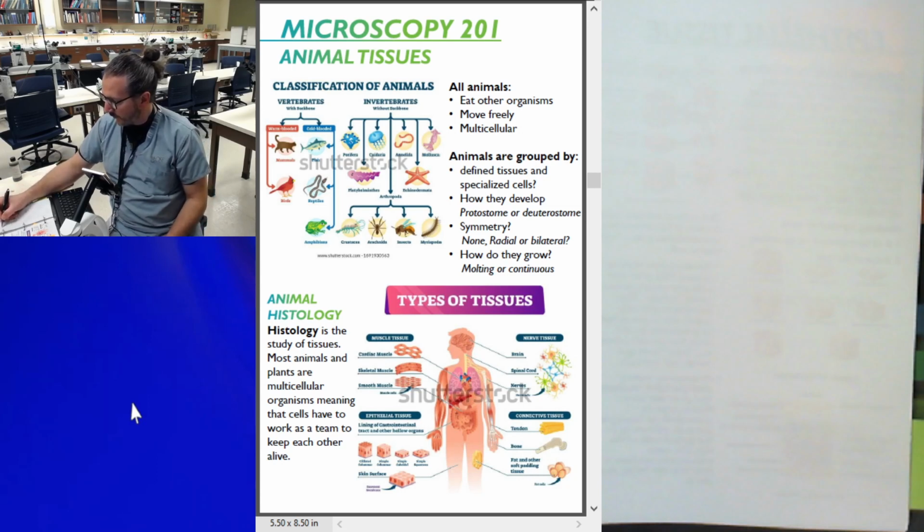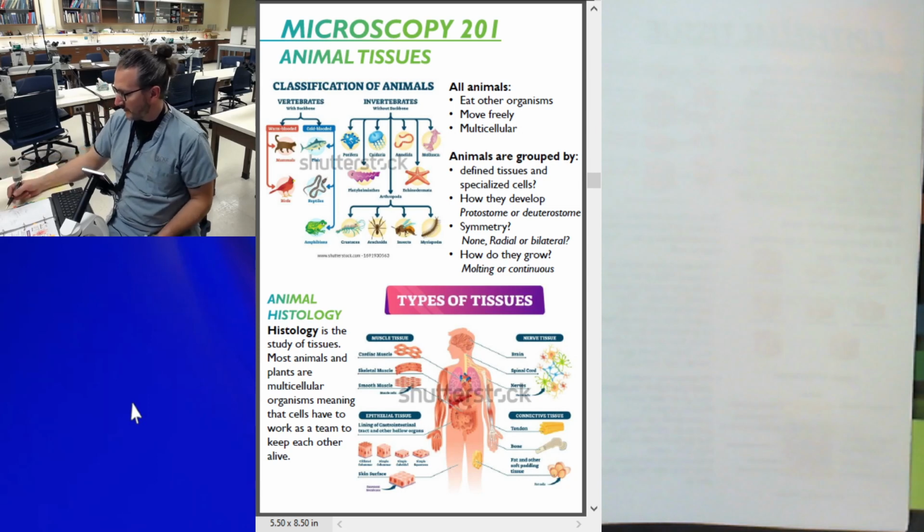The other thing is a white blood cell, WBC. And their color, I'm going to say this, is purple because they're stained purple. Red blood cells don't. White blood cells stain purple. And they're going to have lots of weird shapes.